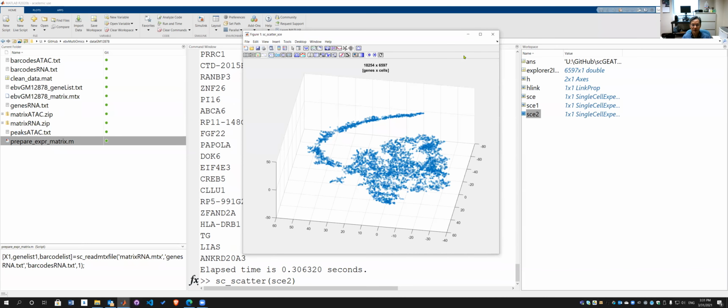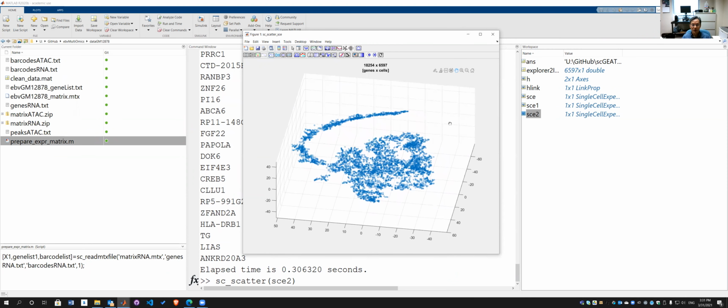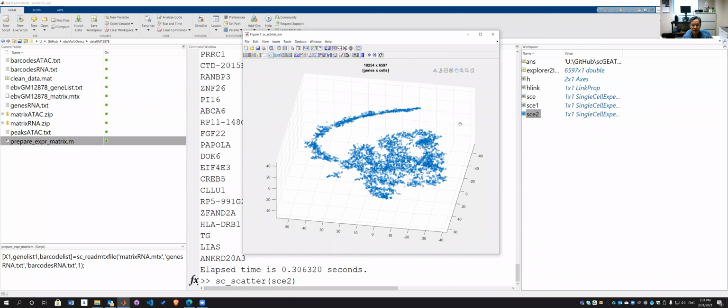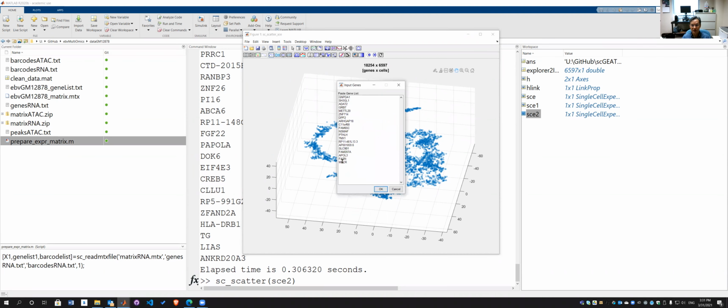There's something wrong with here. Okay. So I'm going to go back and fix this bug, and for the gene regulatory network construction, I don't know why there's a problem here. It's supposed to construct a list of genes. You select a set of genes, the network will be for that set of genes. But it looks like the program right now just gave you a 100 gene as an example. So something is wrong in the middle. So I will double check what's going on.